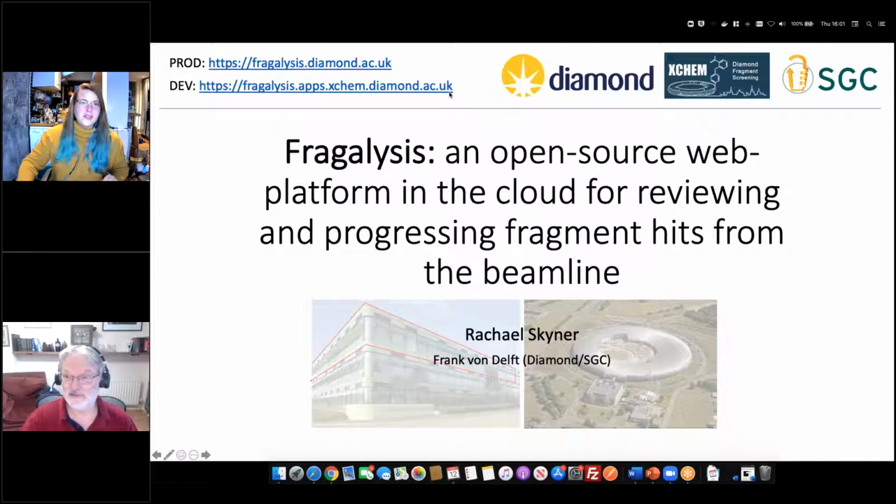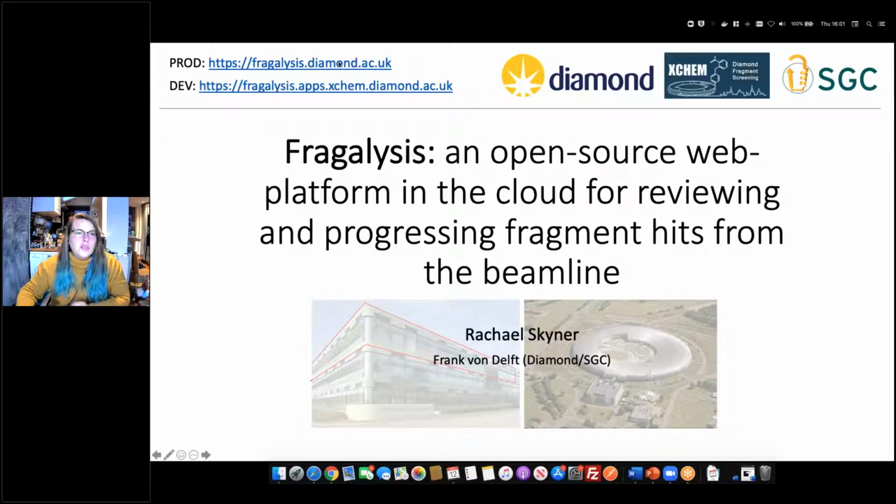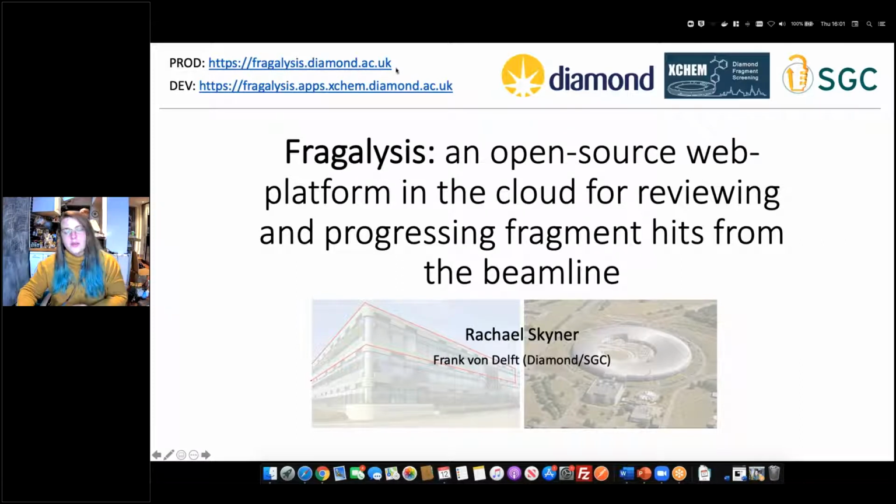Okay, perfect. So if you want to have a quick look at Fragalysis as we go, the production server address is up here, fragalysis.diamond.ac.uk. But I'd hold off a bit until we actually get onto the application stuff. So the title that I've put for the talk is Fragalysis, an open source web platform in the cloud for reviewing and progressing fragment hits from the beamline.